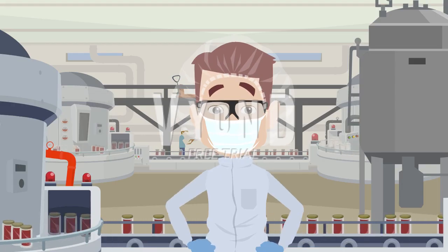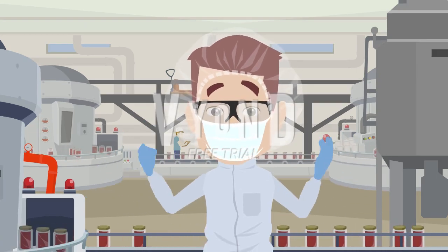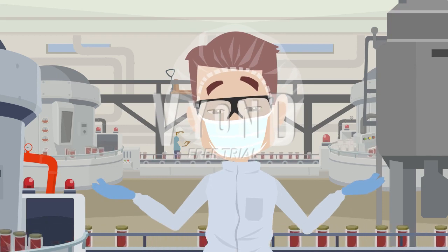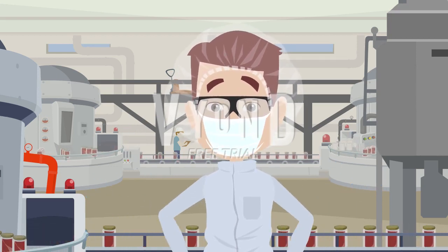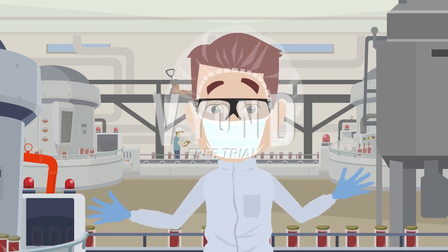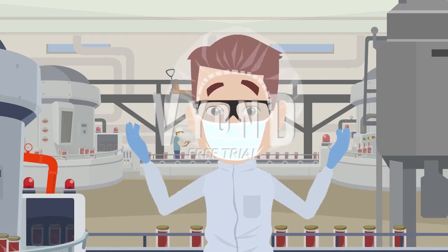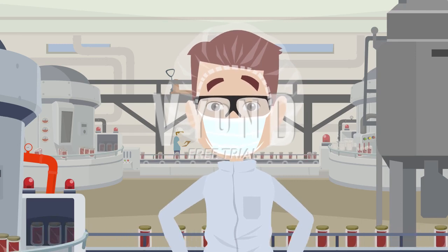The appearance of ointments and creams is critical. Factors such as color, consistency, and foreign matter are evaluated against specific criteria. For example, the acceptance limit for color may be defined as a specific color range or a requirement for the product to match a reference standard. Similarly, the acceptance limit for consistency could be defined in terms of a specific rheological behavior or viscosity range.